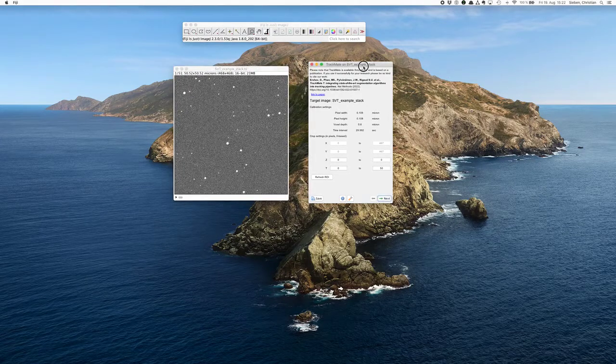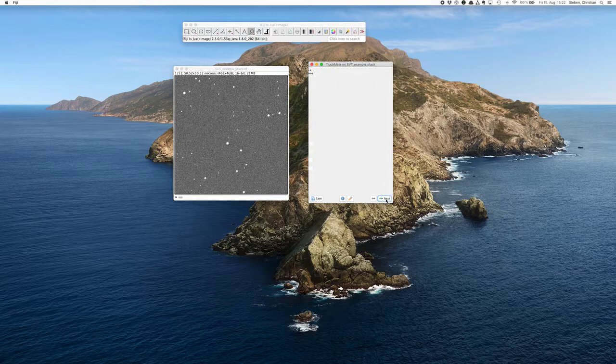Okay, so we have our TIFF stack, and we have opened Trackmate. On the first window, we can select the region that we want to work on. In this case, I want to analyze the entire window, so I don't put in a ROI here. You can simply add a rectangle and then refresh the ROI to only work on that particular window, but I don't do this here. So the first step of tracking is usually to detect the particles.